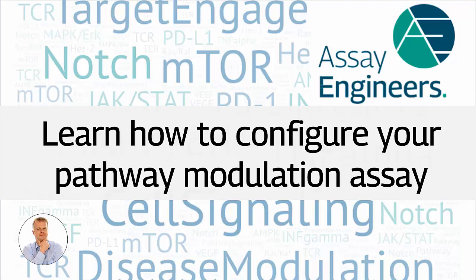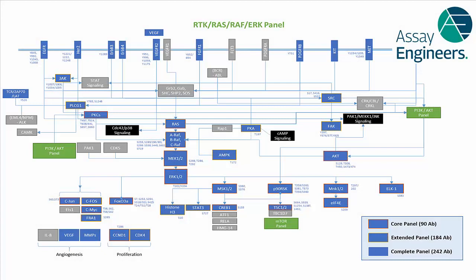In this video I show you how to use the Hyperplex biomarker configurator. Hyperplex protein profiling is a breakthrough, powerful technology that profiles more than 800 protein markers with a dynamic range of 5 logs from just 20 micrograms of sample. The assay menu currently includes more than 1,250 markers covering the top 10% of the intracellular proteome.